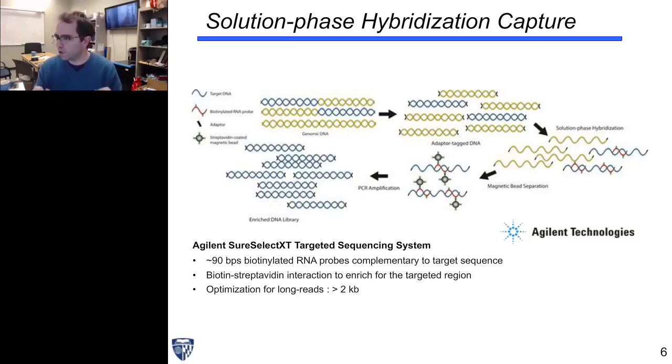So we design our probes, our baits, very carefully so that they're only in regions around, say, for example, P16, a gene that we know has lots of structural variations in cancer. You then would use a magnetic bead, which will bind to these baits, and you can pull out with the magnetic bead just the DNA molecules that you actually care about. Then you can wash away the rest and just sequence what remains. And so now I can sequence in a targeted fashion just the parts of the genome I care about at relatively high depth.